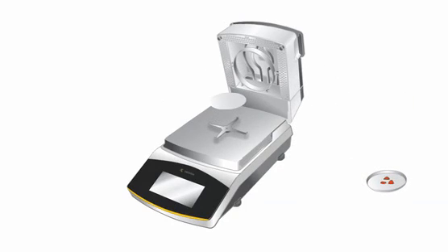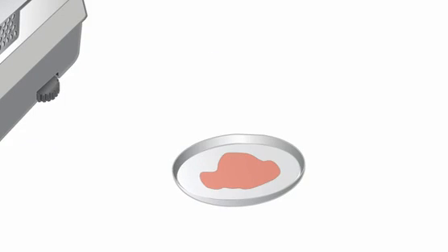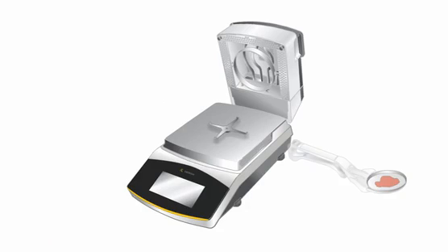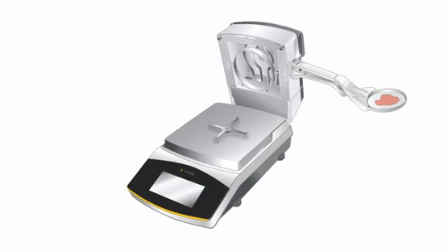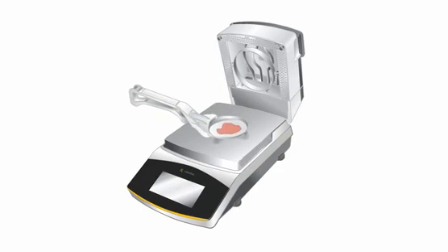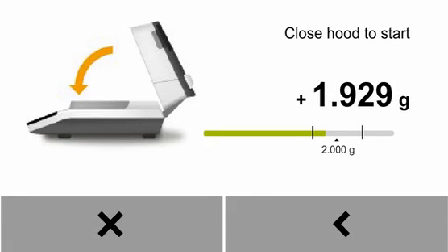Take the lower filter and lay it on top of the pasty sample. Press the filter until the sample is evenly distributed. Place the sample pan with the sandwich on the sample holder. Now, close the hood.